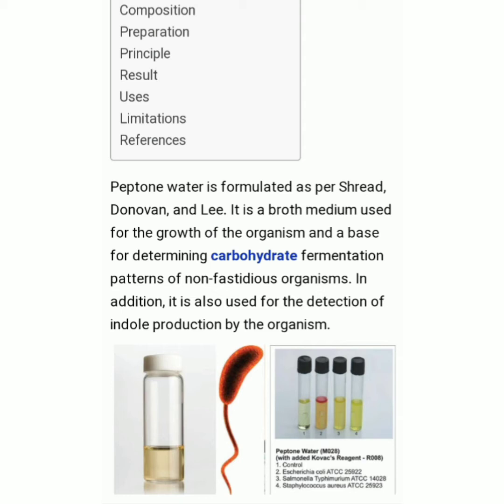So in this video we are gonna discuss peptone water or peptone broth, right? We will talk about the peptone water and its composition, how we prepare it, what is the principle of the peptone water, the result, uses, and limitations, right?